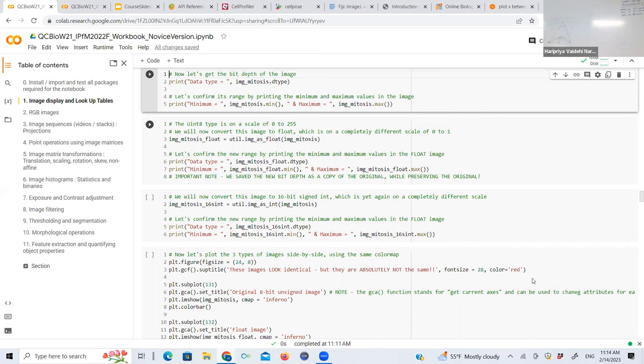In some interfaces, you need to look at the camera specs. It says 12 megapixels, but that's nothing but megapixels. Instead, if you go in and dig up the camera specs, it should tell you the bit depth, and you have to really look for the difference. It's not that obvious.